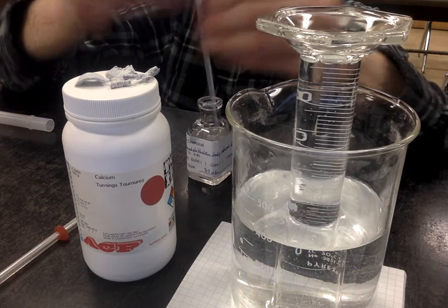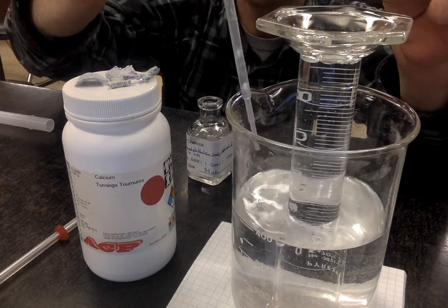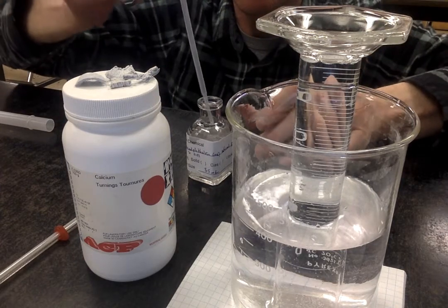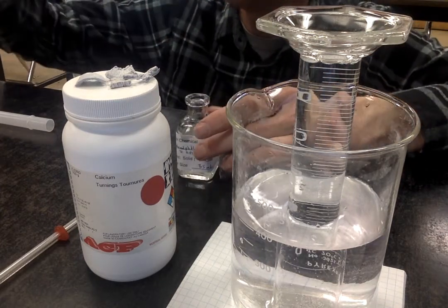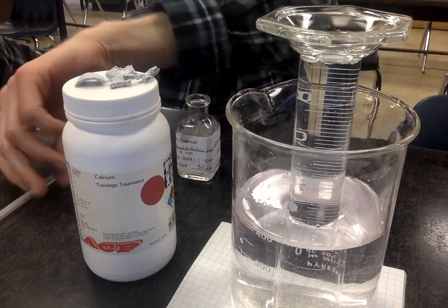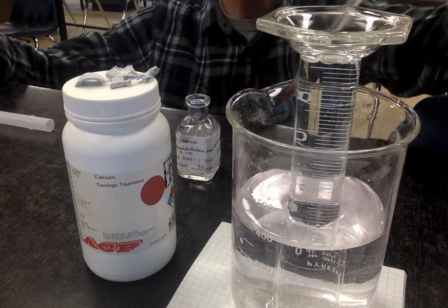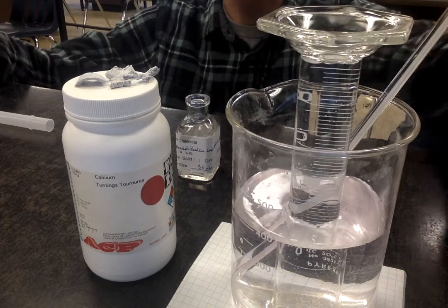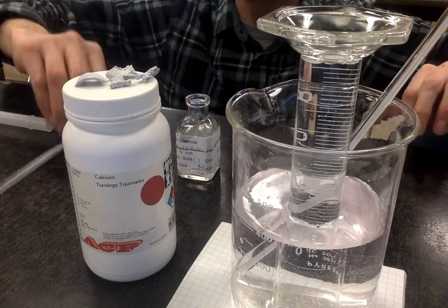I want you to pay attention to color here. And I'm doing the same thing with the other solution. Also, notice I'm putting a thermometer in here. I'll report the temperatures to you once they've stabilized.